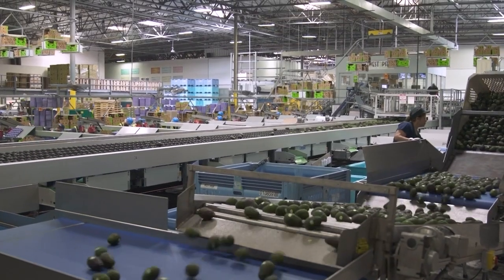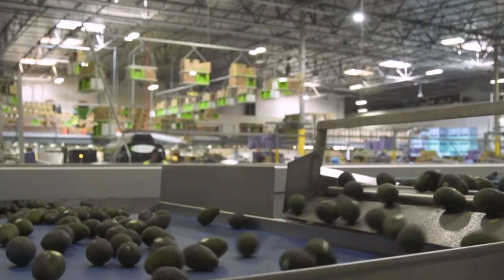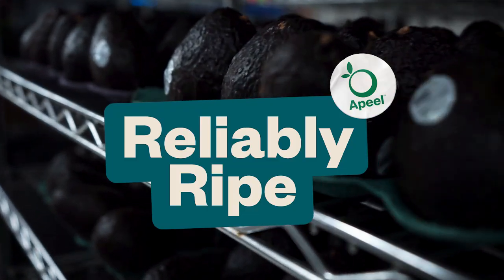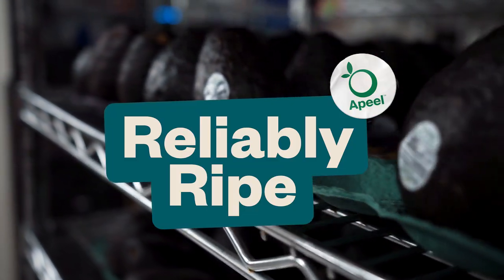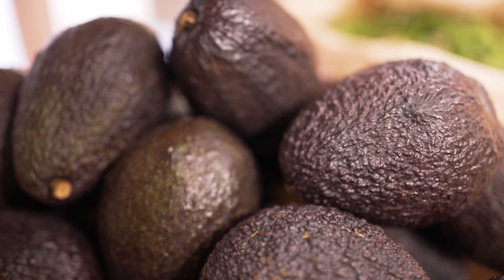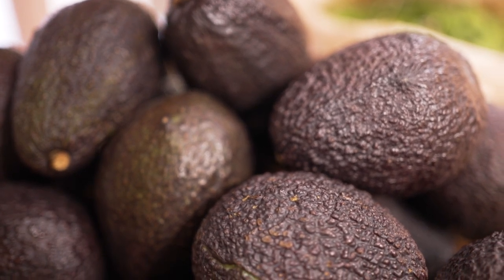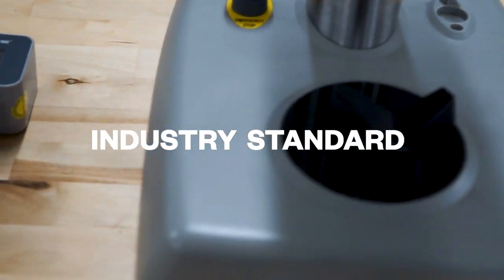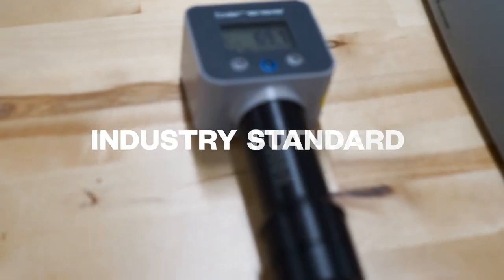These are just a few reasons we've been using the durometer to measure ripeness across our global network of customers, and why we recommend it for our reliably ripe avocado program. So as the demand shifts to a more ripe and ready avocado on shelves, we'd like to suggest that the industry standard penetrometer receive a much-needed upgrade to the industry future durometer.